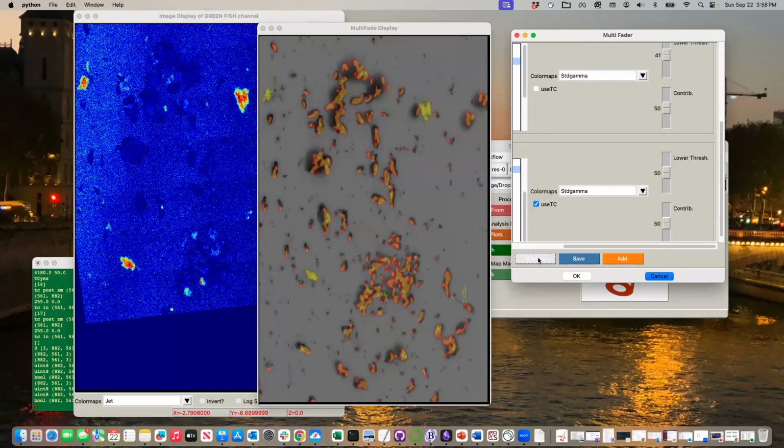So again, if you think about multimodal, you can keep adding things on here, and you're playing with those background thresholds. You could put phosphorus in one, sulfur in another, keep on building up your different channels. And this is also really important if you want to think about how to display like 5 elements of data in a tricolor map without things being ridiculous.